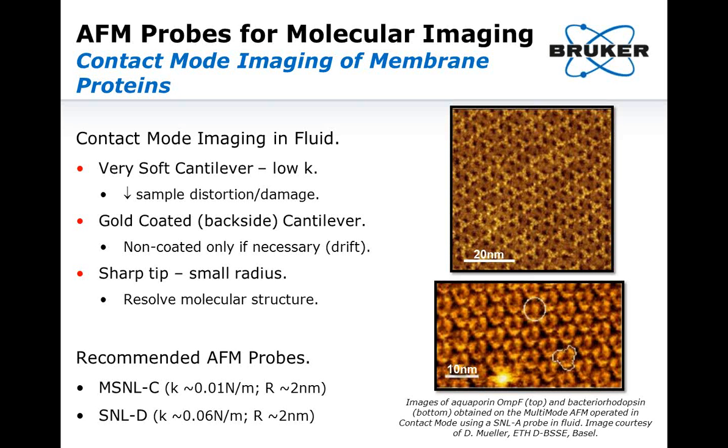Also here for the first time we are coming across contact mode with fluid. For imaging in contact mode in fluid, we also want to use a very soft, very low K cantilever. The recommended probes for this experiment are the MSNLC or the SNLD probes.